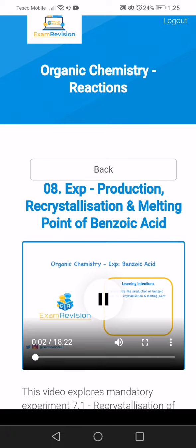At organic chemistry, and we're specifically going to look at our experiments based around benzoic acid. So we're going to look at the production, recrystallization and melting point of benzoic acid. So first we'll look at the preparation of benzoic acid.